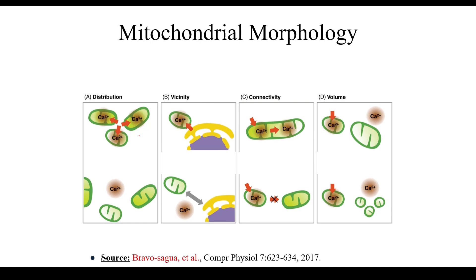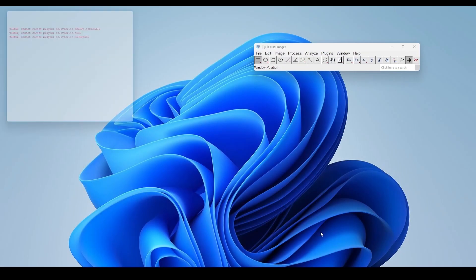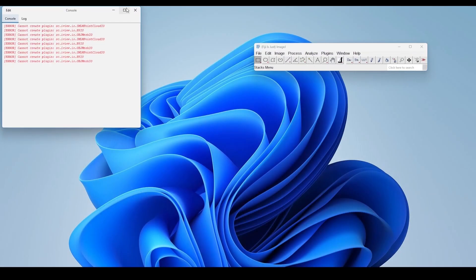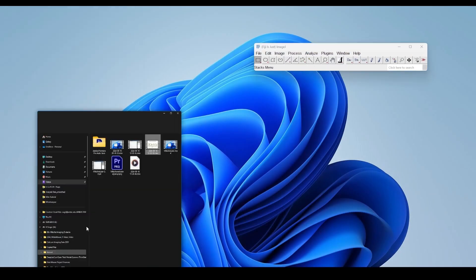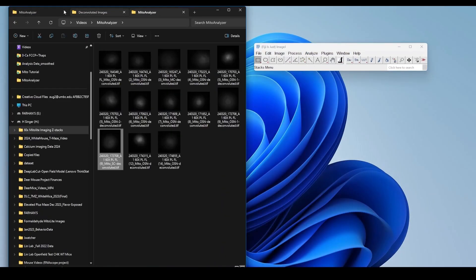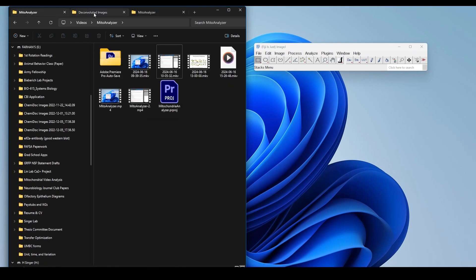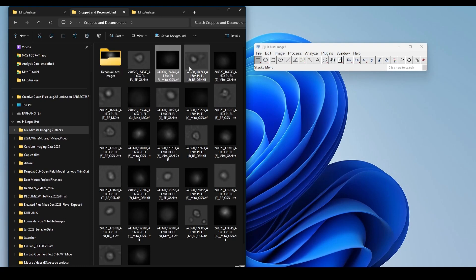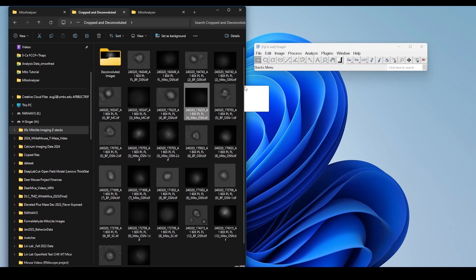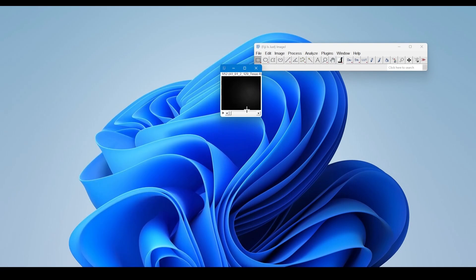So without further ado, let's get started. I've opened my ImageJ and I'm going to navigate over to the folder where I have my images saved. I'm going to randomly pick one to demo this out for all of you.